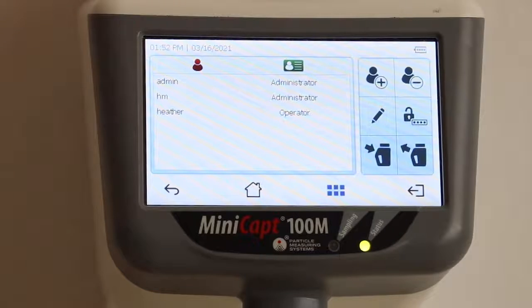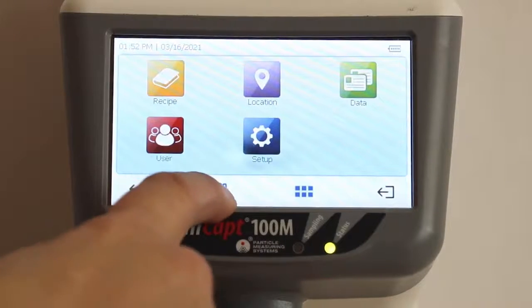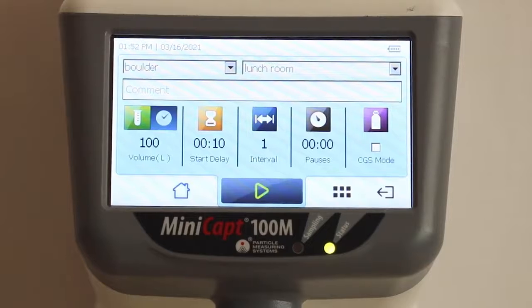in to use it. So you can see the instrument is very easy to use, and it can be very specific. It can be beneficial to have different recipes for different areas and make sure that you have users sign in. You can always look at those reports, and you can always go back and have traceability.